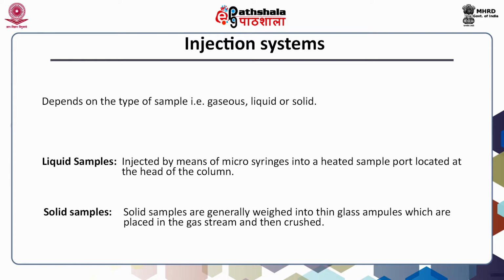Now, as I said, for gas liquid chromatography the sample should be in a vapor state. Some of the materials are highly volatile, so they do not need any treatment, but some materials are not that volatile, and one has to make them more volatile. So, derivatization is generally preferred. For example, in case of fatty acids, methyl esters are made to make them more volatile, so that they are easily converted into vapor, because the requirement in GLC is that they should be quickly converted into vapors, then only the resolving of the components will be very efficient.